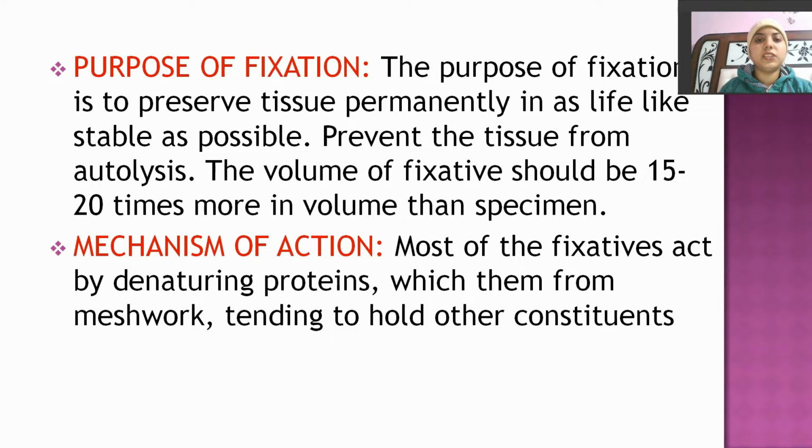The purpose of fixation is to preserve tissue permanently in as lifelike a stable state as possible and prevent the tissue from autolysis. The volume of fixative should be 15 to 20 times more than the volume of the specimen. The mechanism of action is that most fixatives act by denaturing proteins, which form a meshwork tending to hold other constituents.